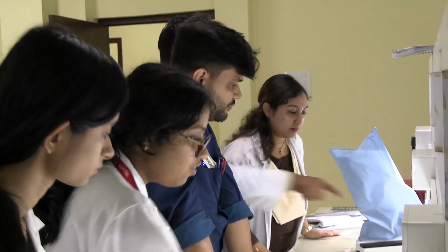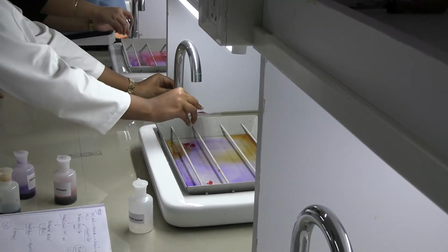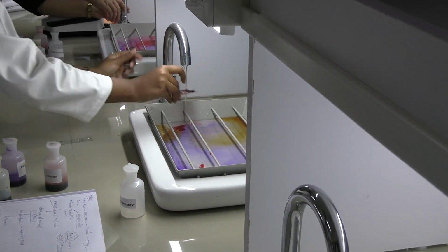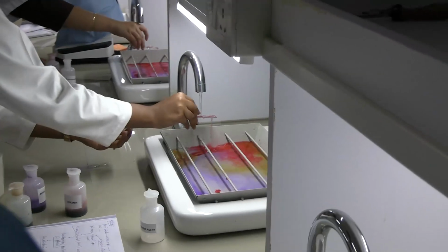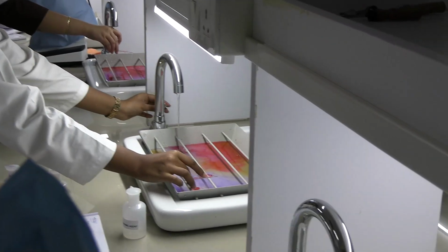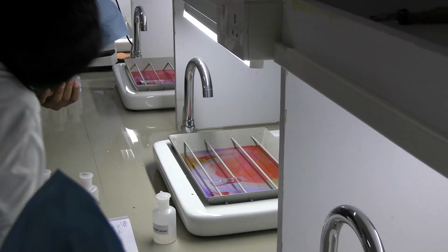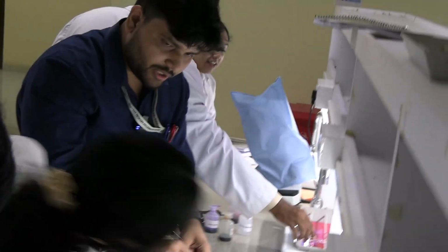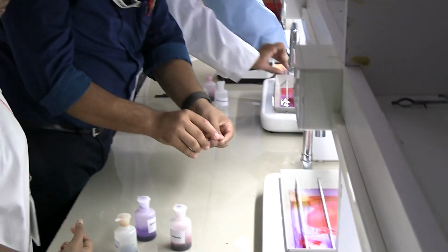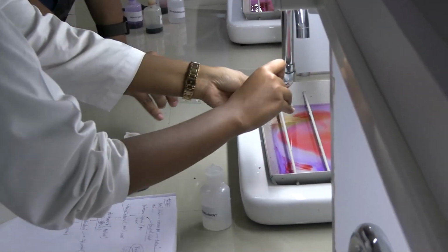Is it hard? So wash it. Otherwise you're again doing it wrong. Sorry, sir. It's again wrong. She's doing it right. You're gonna wash it, you're gonna hold it like this and allow the finger. What you are doing, you are doing it like this. So the smear can't get washed, okay?